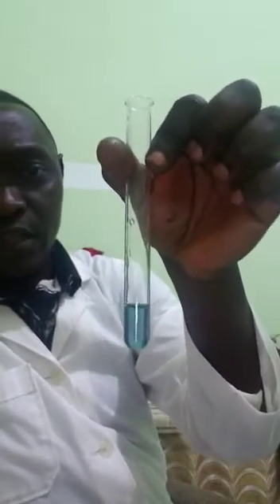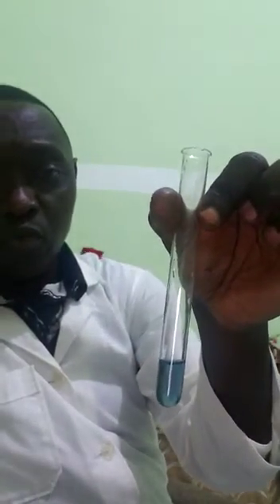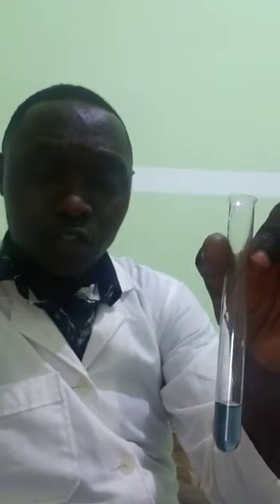Once you homogenize, we observe that the solution stays blue. This indicates the absence of proteins in this food sample.